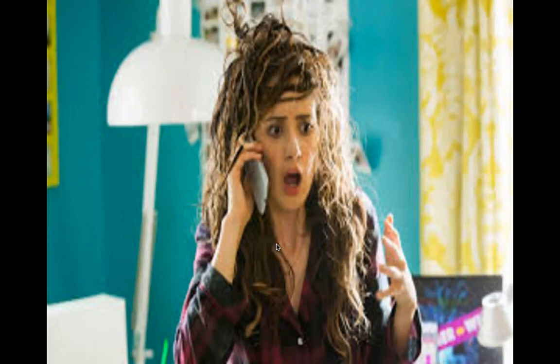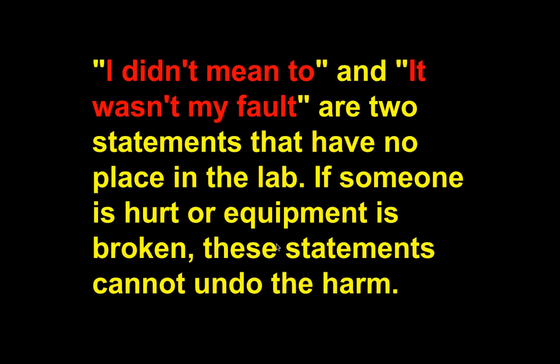Something like this could happen if you think, 'What would happen if I poured this over someone's hair?' Ultimately this is what you could end up looking like, because it could be an acid. So you're not doing experiments on people. A lot of times people want to be funny and pour stuff on people, but you never know when monkeying around could result in something happening. Statements like 'I didn't mean to' and 'it wasn't my fault' have no place in the science lab.